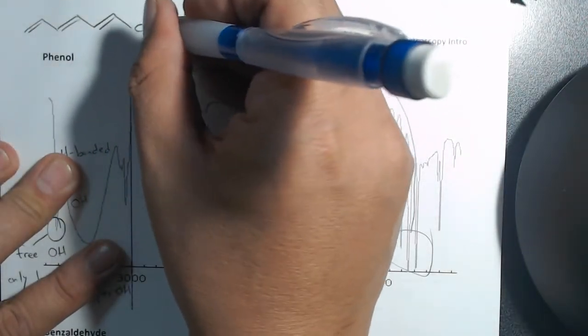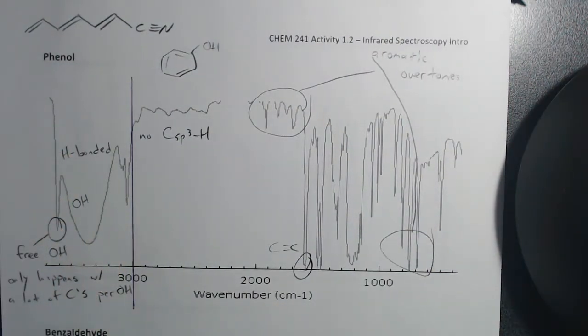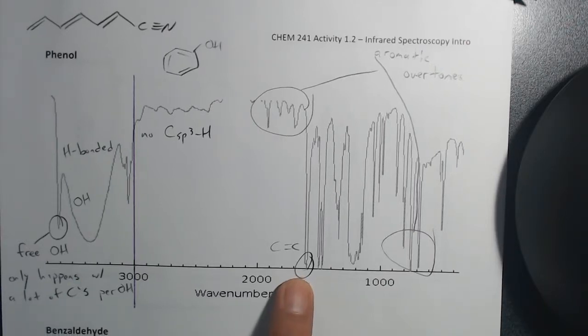If you were to capture the IR for this compound, because it has all of the double bonds in conjugation like a benzene does, you actually have aromatic overtones in that compound. So it's not 100% reliable, but it's likely. The reason why I think it's mostly unreliable is because sometimes they're not even there. So if they're not there, that does not automatically rule out aromatic. You will have the double bond though. The C double bond C is guaranteed to be there, but the aromatic overtones are not. They might be there, and hopefully they are when they are.